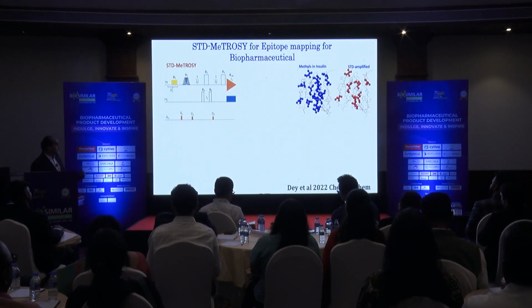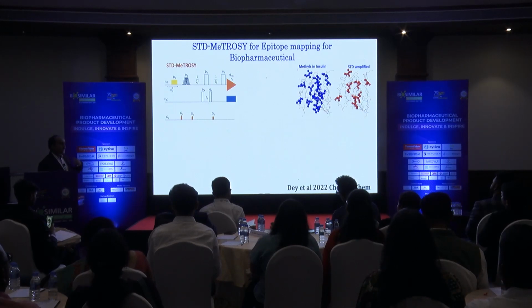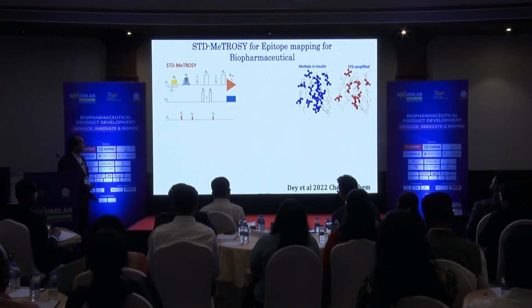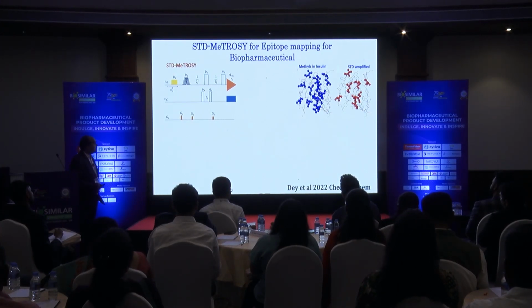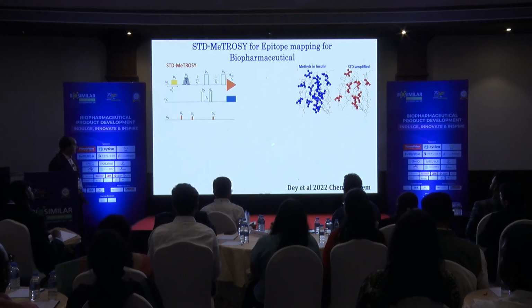And we can even assess their binding. So we developed a method using STD methyl TROSY, where we transfer the magnetization from the IGFR, which is known to bind. This is our pulse sequence, I will not go into detail. And these are epitopes where it can bind. So these are methyls basically. So we use this technique, STD methyl TROSY, to show where insulin binds with the receptor.